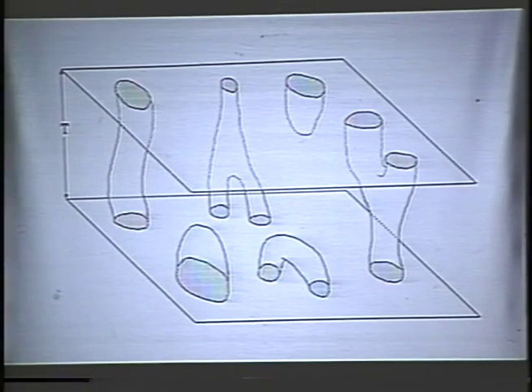For me, if I'm looking at the contours of a taste bud, which is a large structure, I may use 1 micrometer thick sections. If I'm going to reconstruct a cell, I may use 0.5 micrometer thick sections. But if I'm going to look at the details of a synapse, I will cut sections absolutely as thin as I can get. So even within one system, I try to tailor the section thickness to my needs. Next slide.